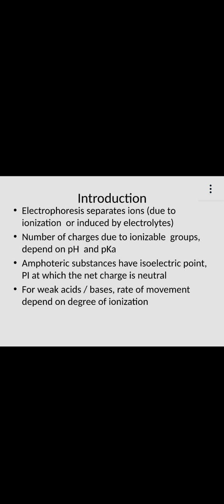So the separation will be influenced by a number of factors. And one of the key factors is the charge on molecules. And as we have seen in our series of discussions, the pH and the pKa is critical. But in electrophoresis, separation can also be achieved by utilizing induced charges.